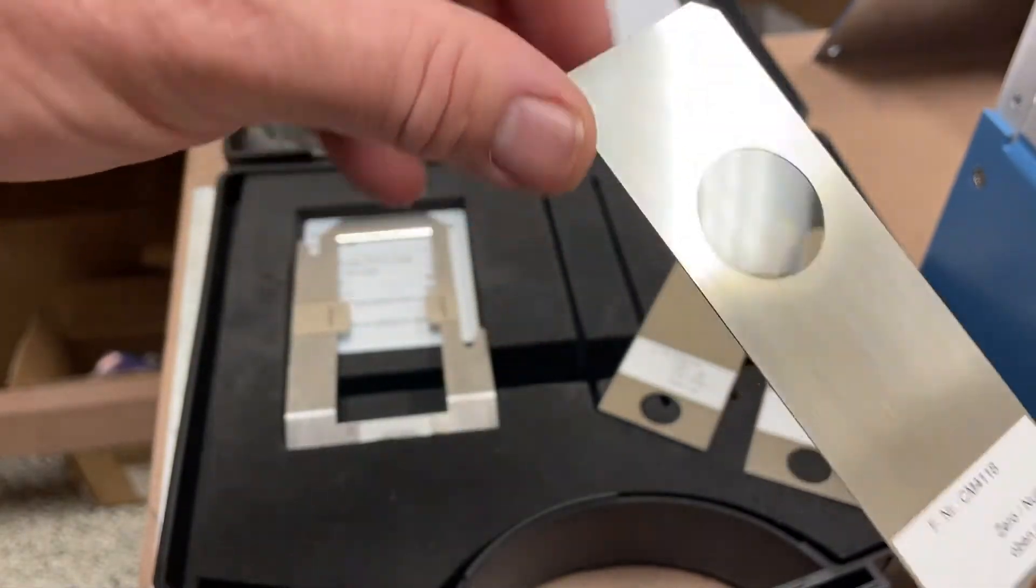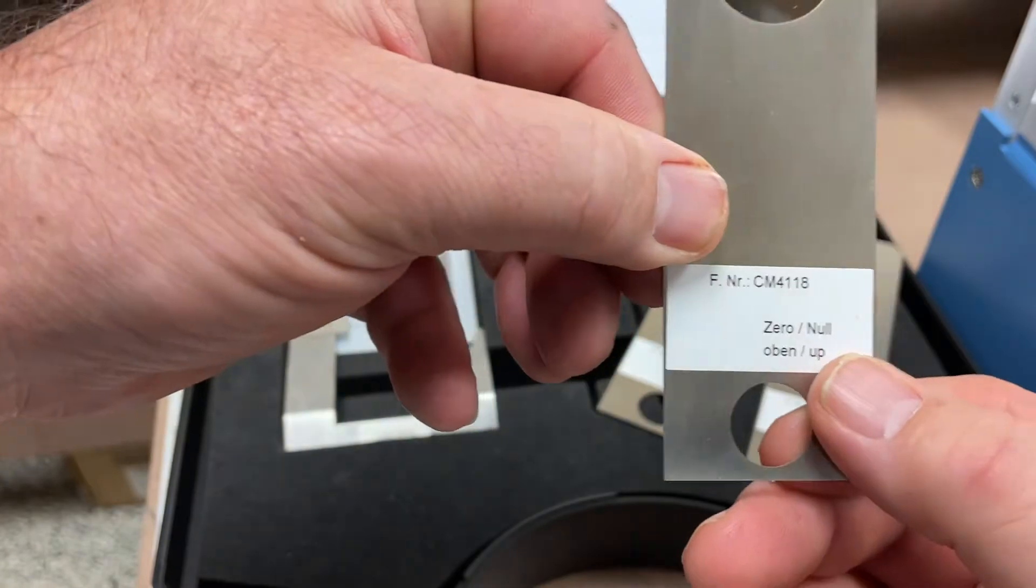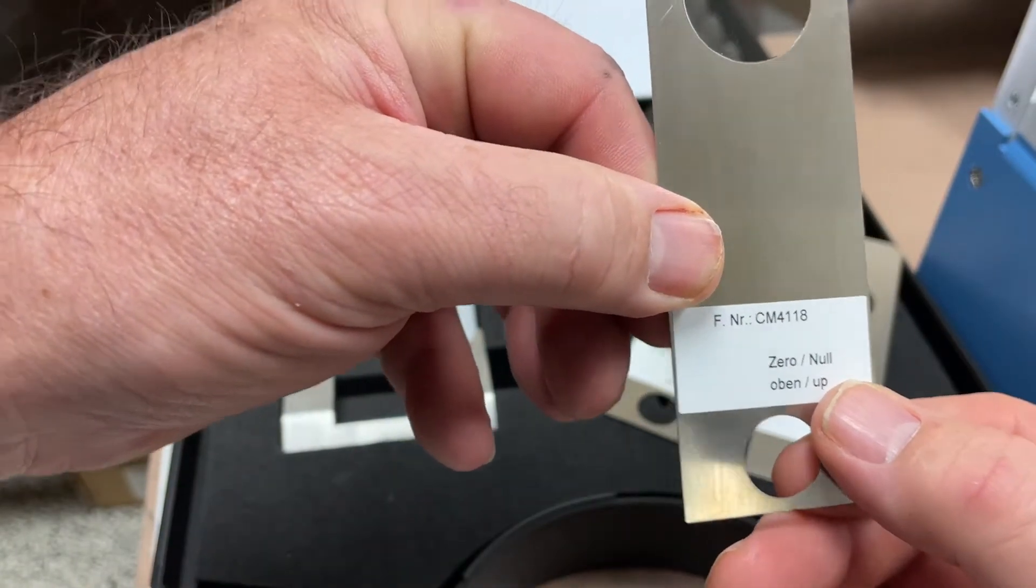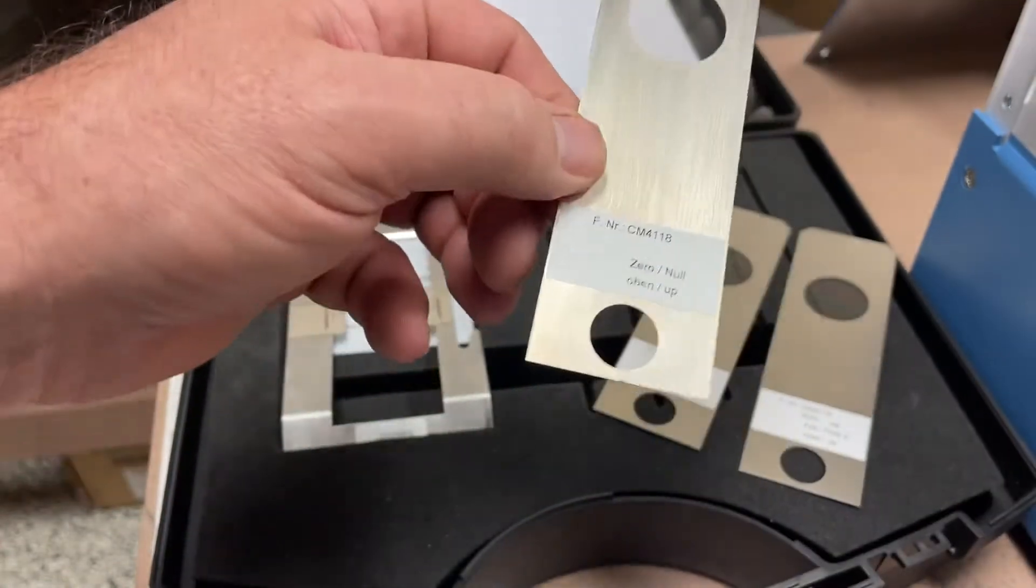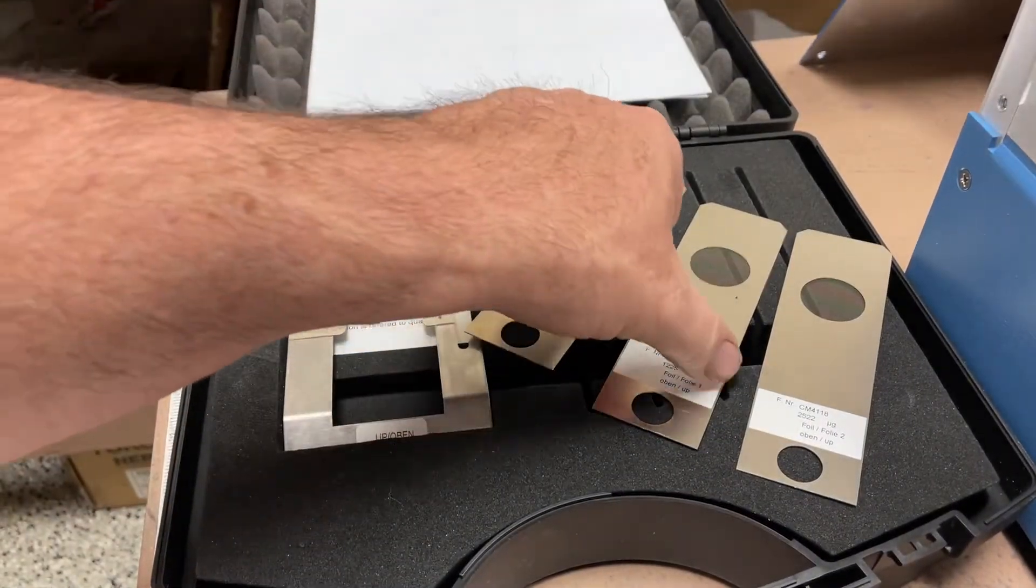This one is labeled zero null, so if you put this into the detector, it should read zero on the front panel of the instrument—zero micrograms.